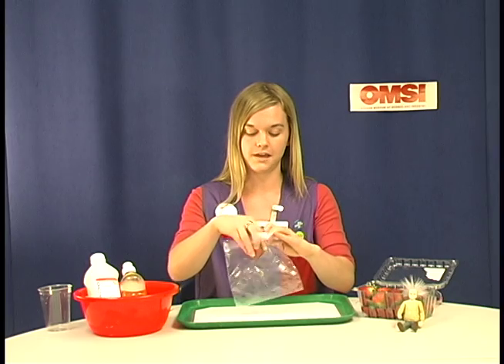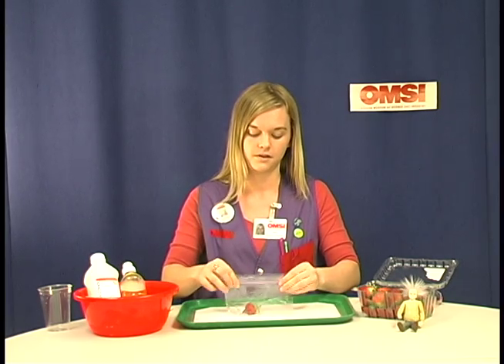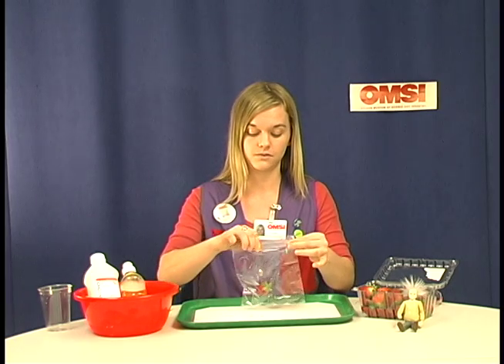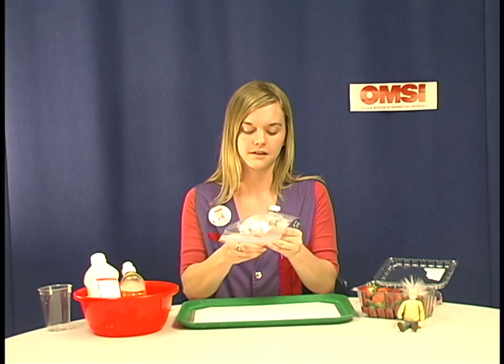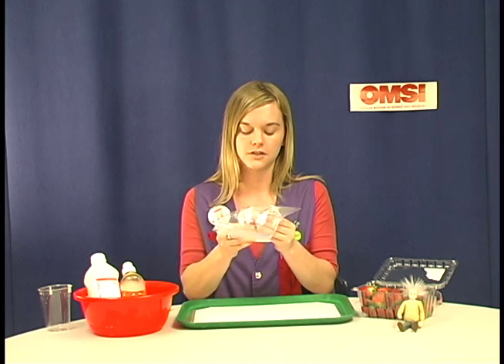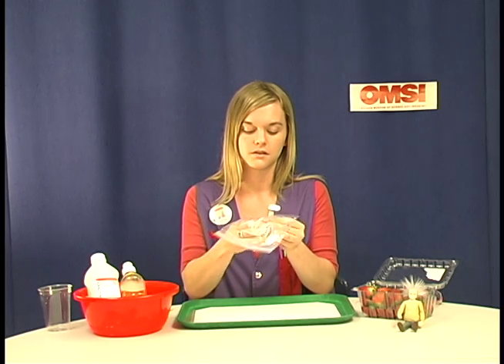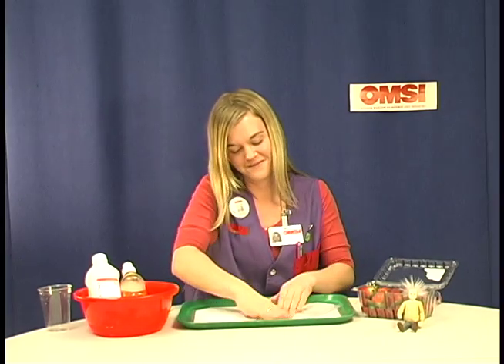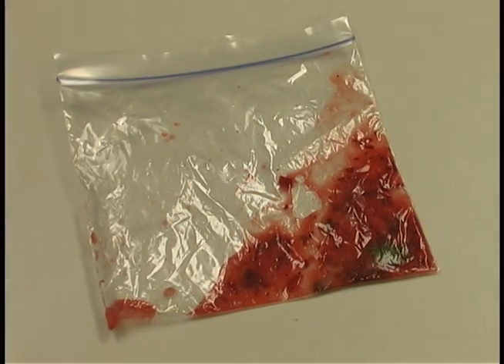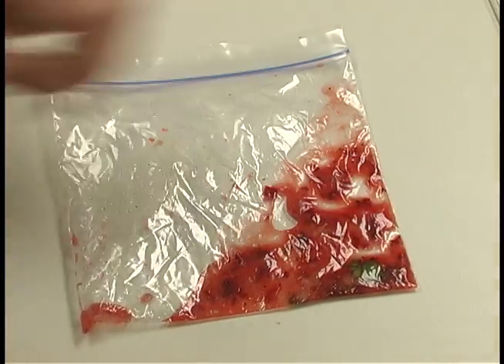So you want to stick it in a ziplock bag, and you only need one strawberry per group. Make sure that the bag is sealed tightly. You're going to want to mush the strawberry in the bag, and it just needs to be the right consistency, so really just no chunks need to be left.